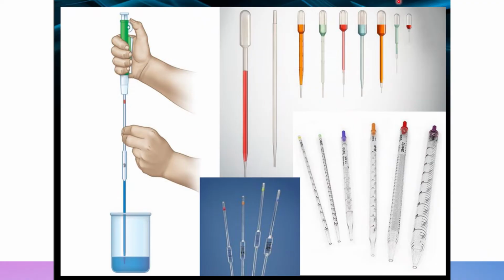While the meniscus level is held in place, the pipette tip is raised slightly out of the solution. So you remove it out of the solution and wipe it with a laboratory tissue of any adhering liquid. And then the liquid is allowed to drain until the bottom of the meniscus touches the desired calibration mark.